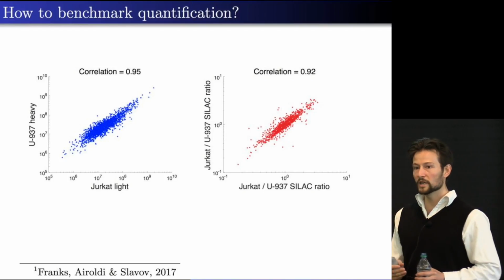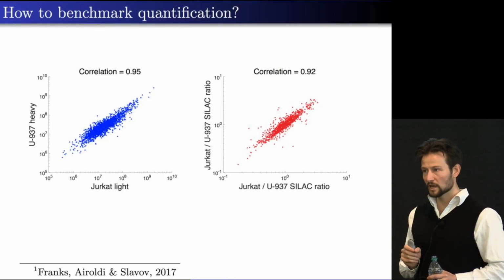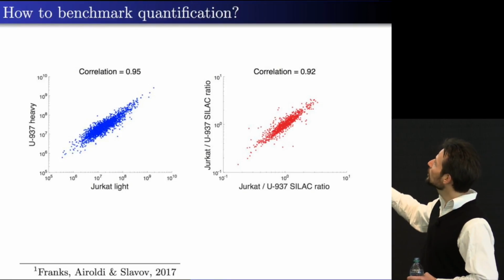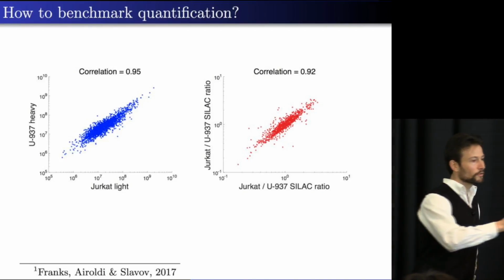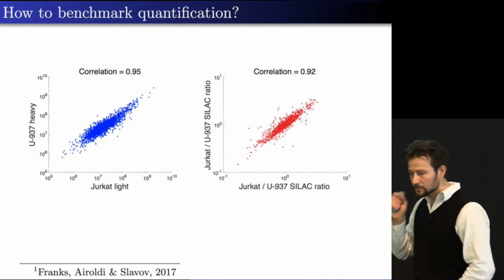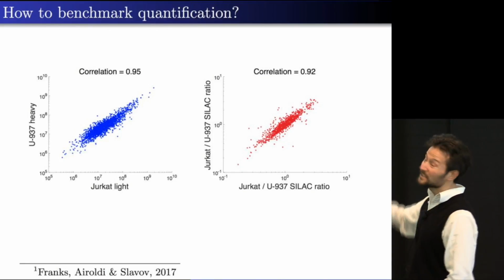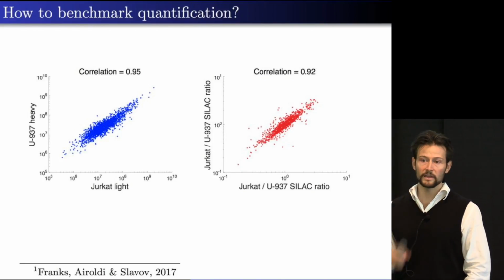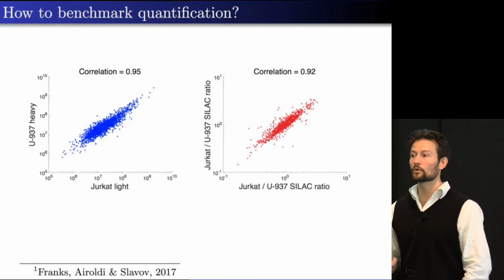They're just being squished. And this is one of the caveats that I think we as a community should actively try to avoid. We cannot just plot this kind of log-log plots in 5 orders of magnitude as an estimate for relative quantitation, because just about any cell type that I put in here, any cell that I take from your body, if I just quantify the peptides, put it on the y-axis, you're going to get astoundingly high correlation.